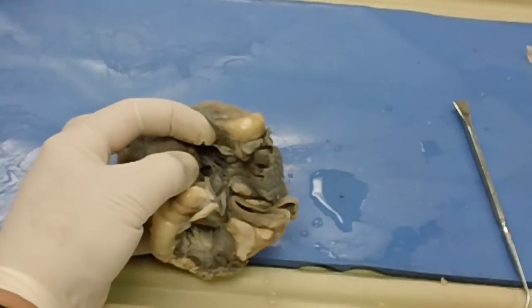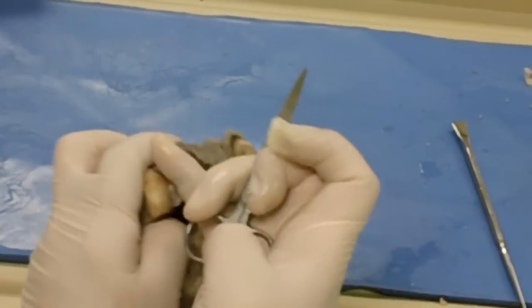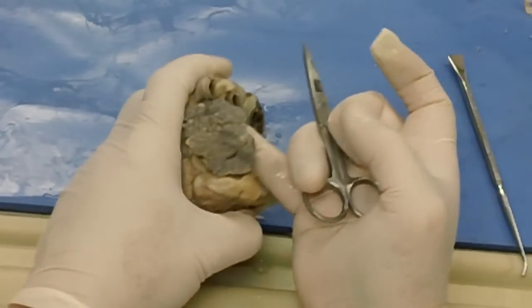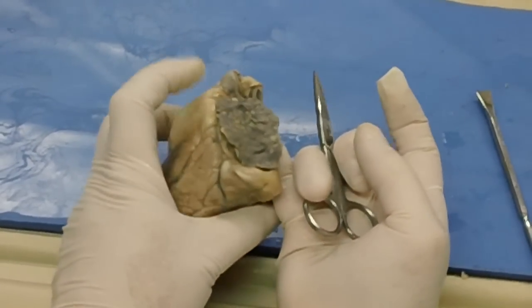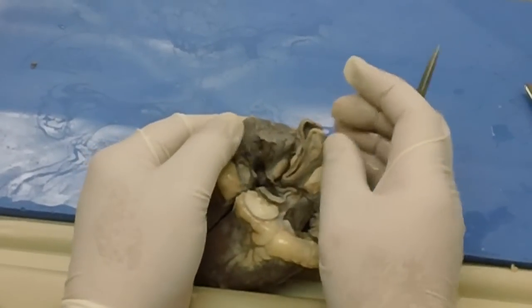So, blood's coming back into the heart through the left atrium, which is right here, my finger's in it. This funny looking thing over here is called the left auricle, or left auricular appendage, and my finger can actually get in there. This is just an added storage area for some blood before it pumps.